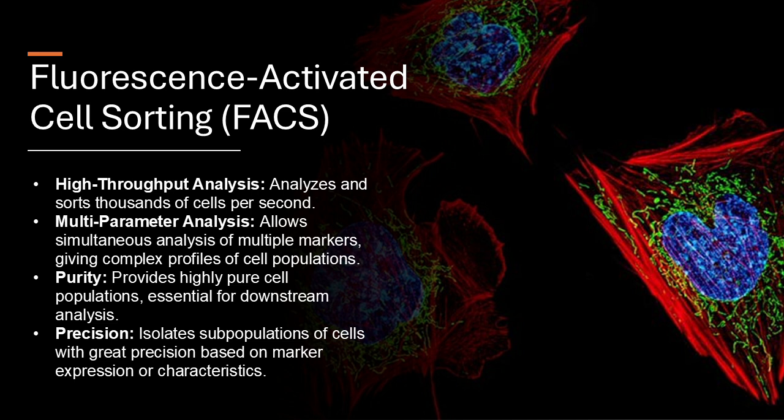Okay, so it sounds like FACS is like a high-tech sorting machine for cells. How does it actually work, though? It must be so precise to work with something as tiny as a single cell. It is, yeah, it is incredibly precise.